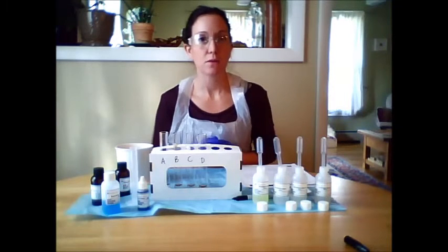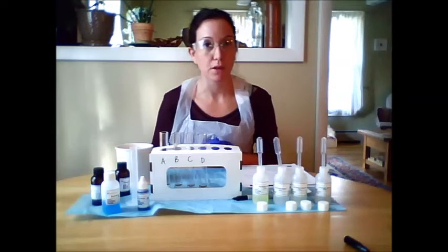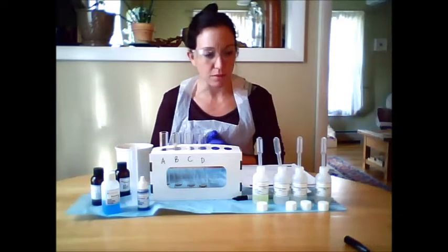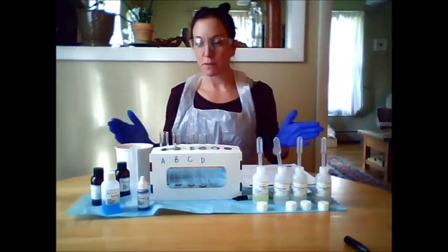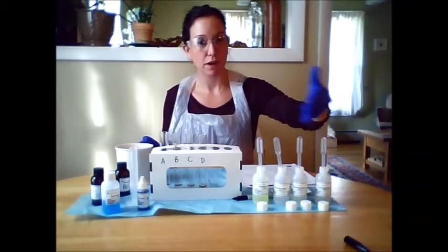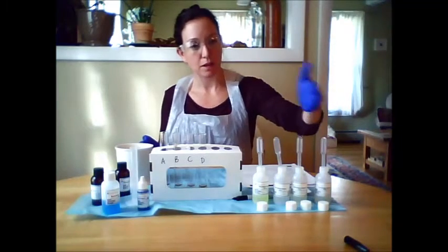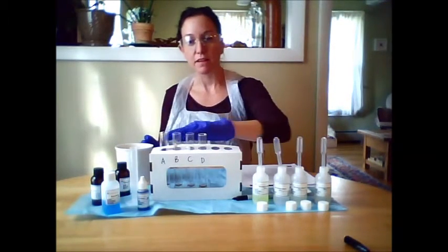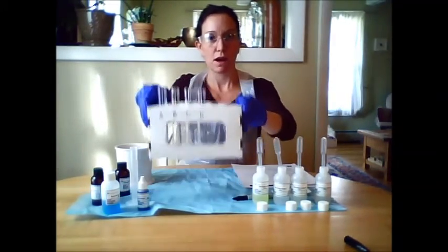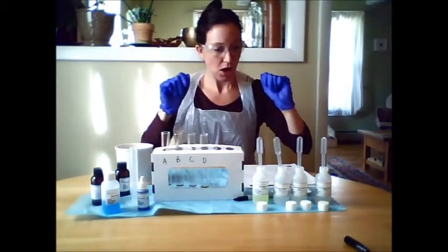Hello class, now we are doing the second part of the mammalian homeostasis lab. This is the experiment with the simulated urine. I have my materials laid out for me. I have the simulated urine right up here, labeled A, B, C, D. My test tubes are A, B, C, and D. I've labeled them on the rack for you.